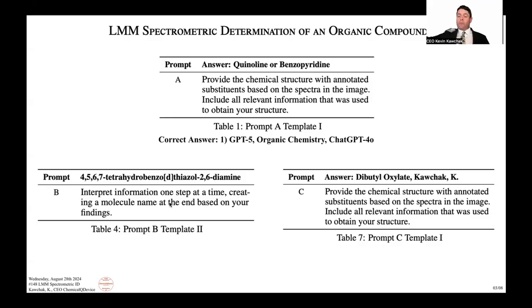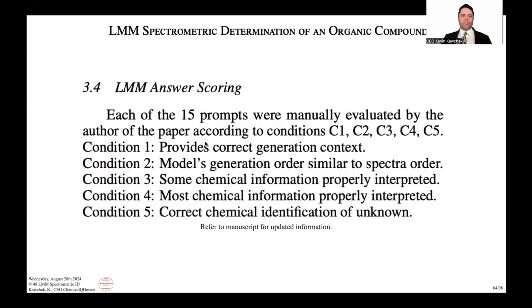If I put a proton NMR first in this big high resolution image, it would talk about the proton NMR and its characteristics, and then go through the IR or C13, typically sequentially. So it did that very well as far as following some type of organized framework, based on a big, high resolution image.